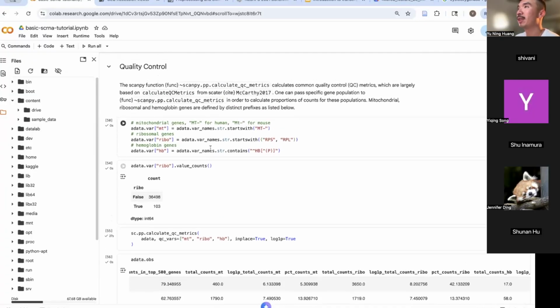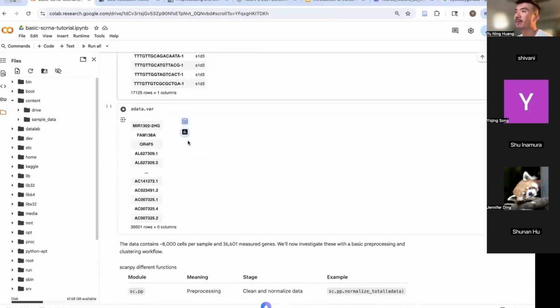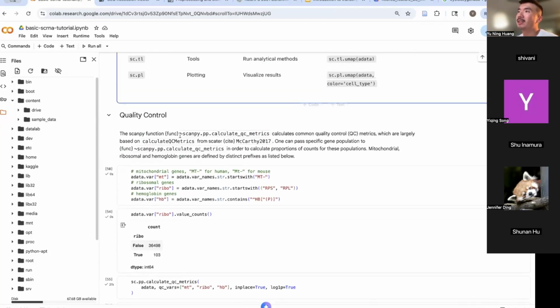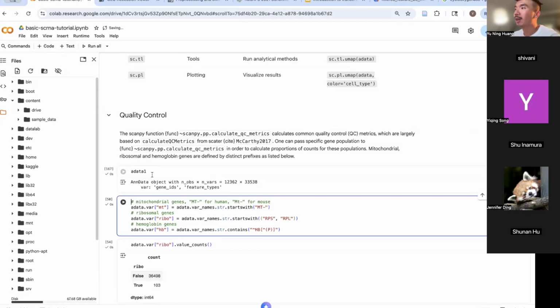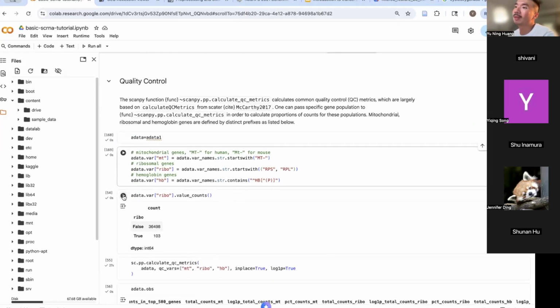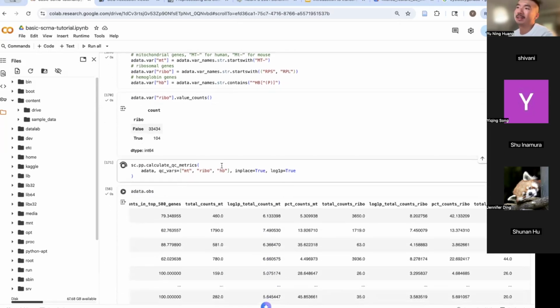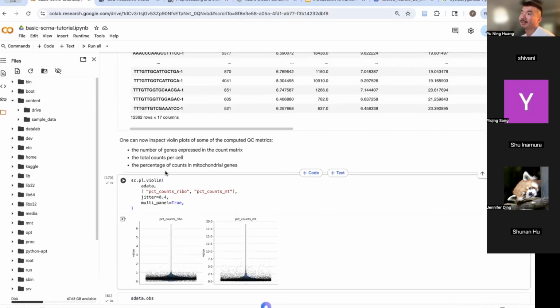So I think I imported them as a data one. If you're even lazier, I imported those metrics as a data one. You can save a data one into a data, so then you will just overwrite the a data and then you just click it through. And then you can do the same analysis for a brand new data set.